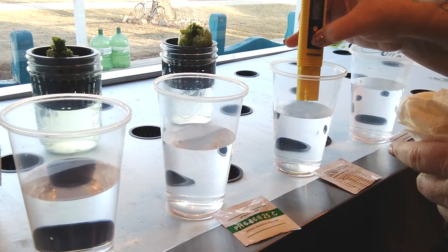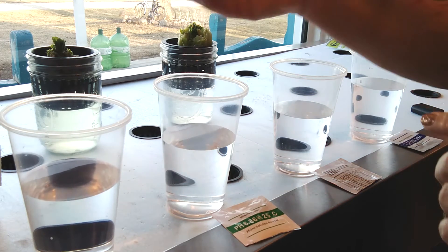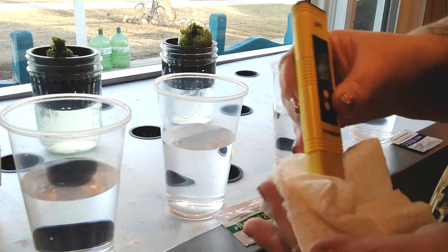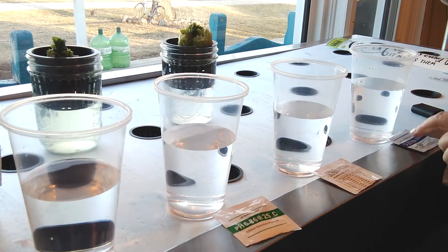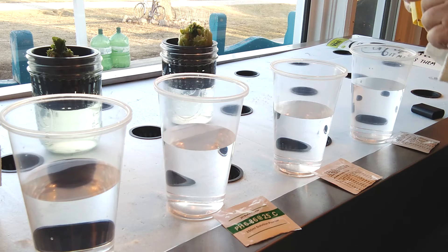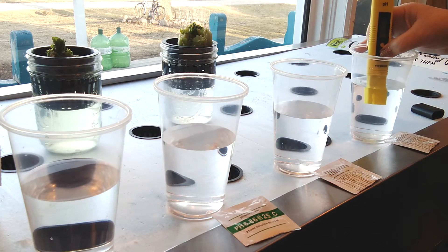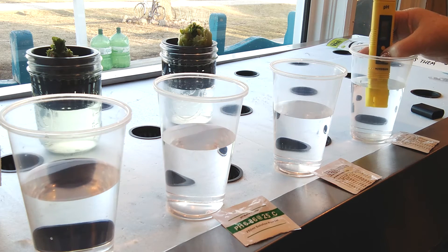Now we're moving to our second solution. At 20 degrees Celsius we are going to look for 4.00 on this one. We're going to put this in and hold down for five seconds. It says 'end' and it did say 4.00 before it said end, so we know that one is correct. Again we're going to rinse this off and lightly dry.